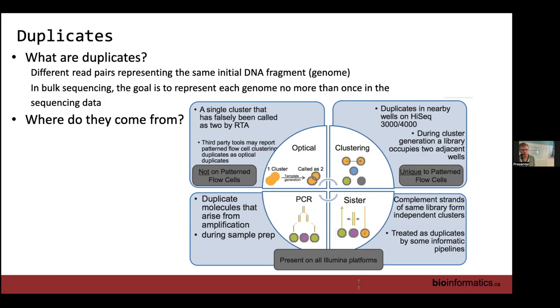We're pulling DNA from a whole bunch of different cells, a whole bunch of different genomes, but we don't want to see some kind of bias where for some reason all the information in one cell we're seeing over and over again. That's called duplication. It arises especially with the prep stages and library prep, because we're doing PCR. We're amplifying our DNA to get enough of it that we can run through these reactions and generate libraries. Bernard mentioned there are a number of methods that are PCR free. That's part of the reason they do that.